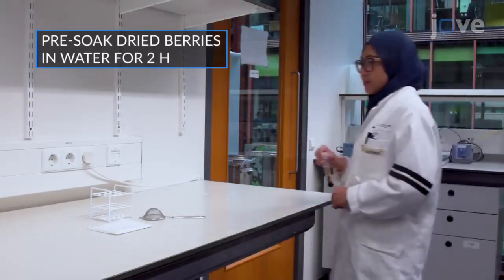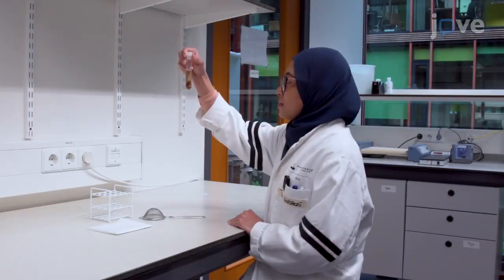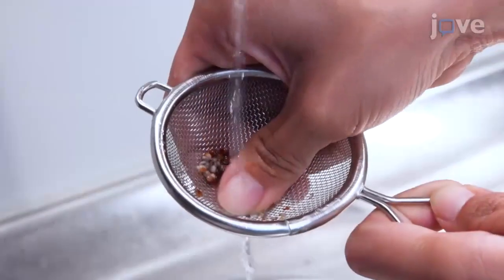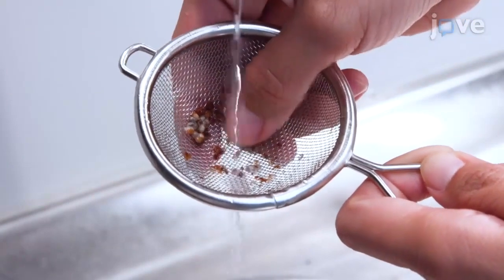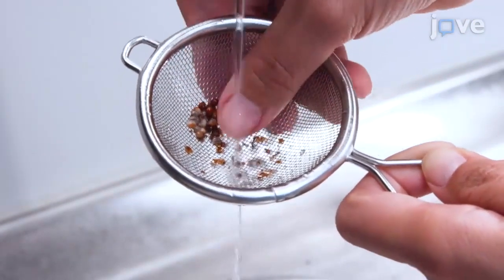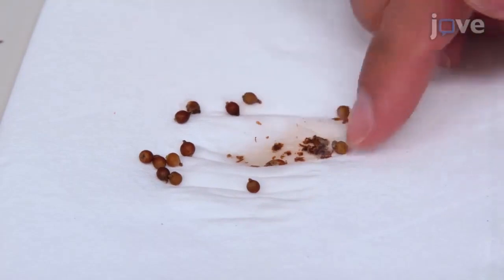To grow Parasponia andersonii trees, begin by germinating the seeds. Remove the seeds from Parasponia berries by rubbing against the inside of a tea sieve, or squashing them on a piece of tissue paper.